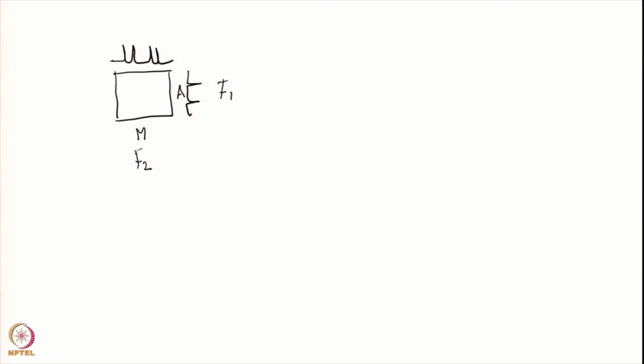Okay. This peak is arising from JAM, okay. Therefore JAM is called the active coupling.